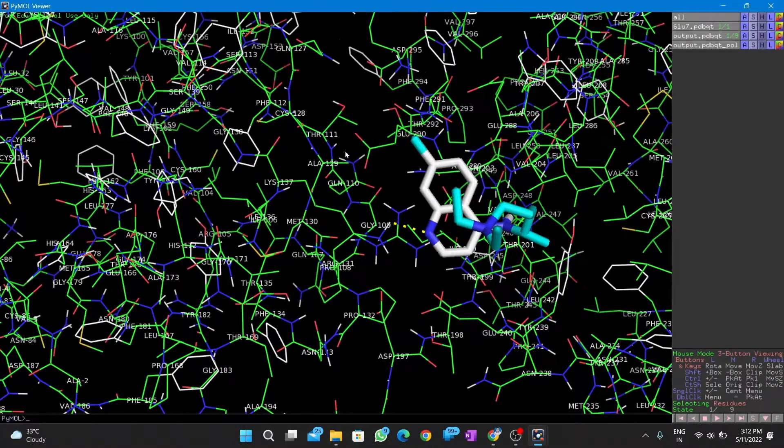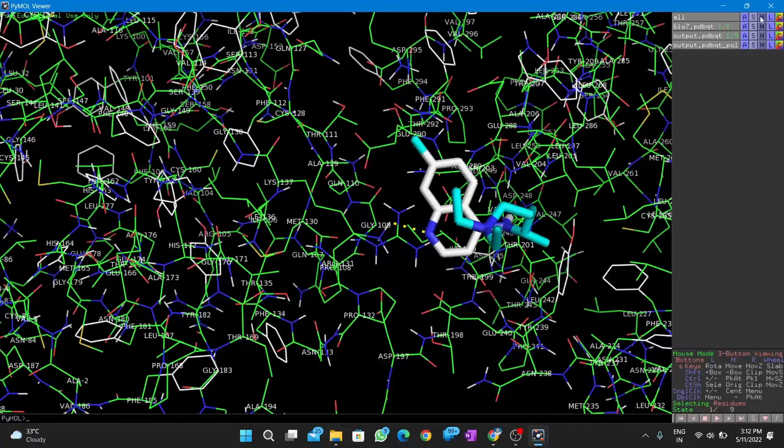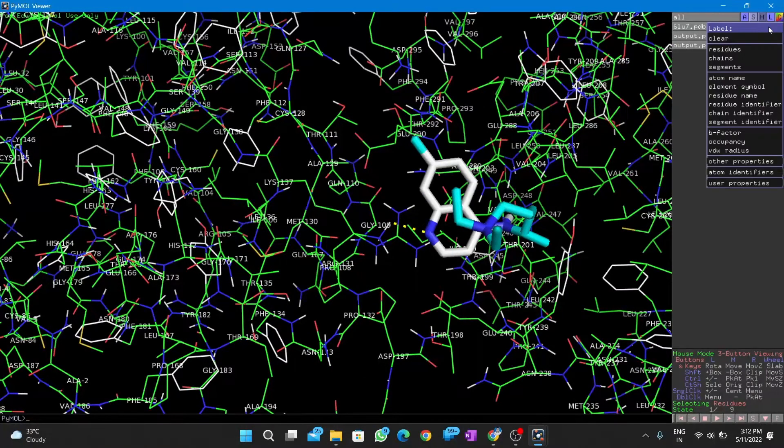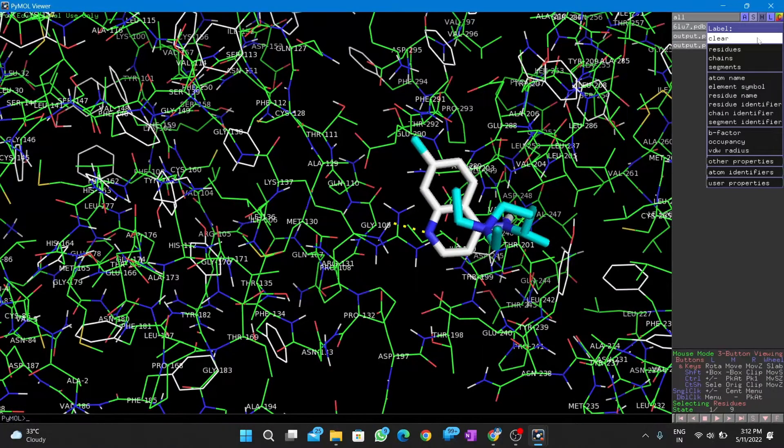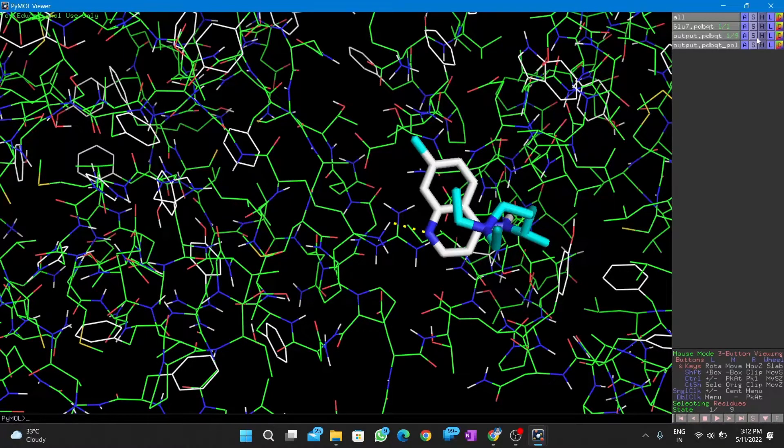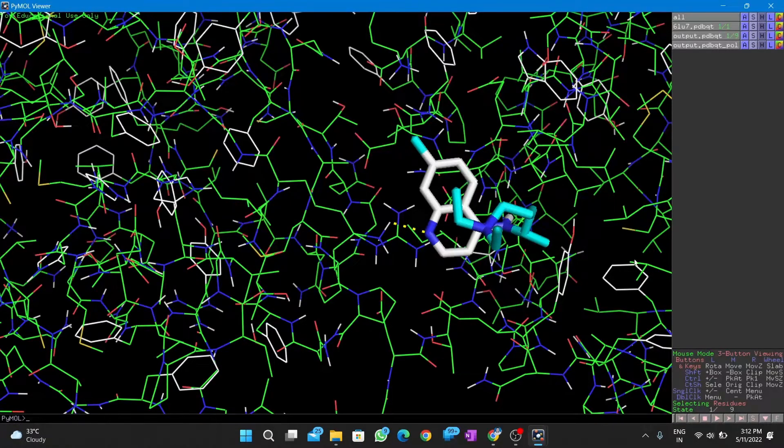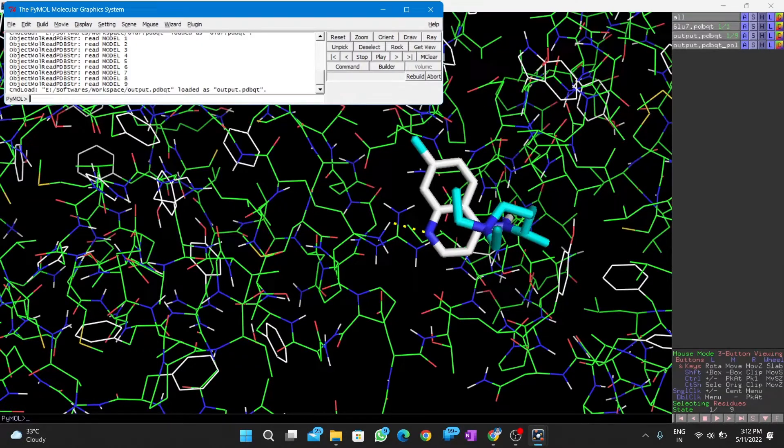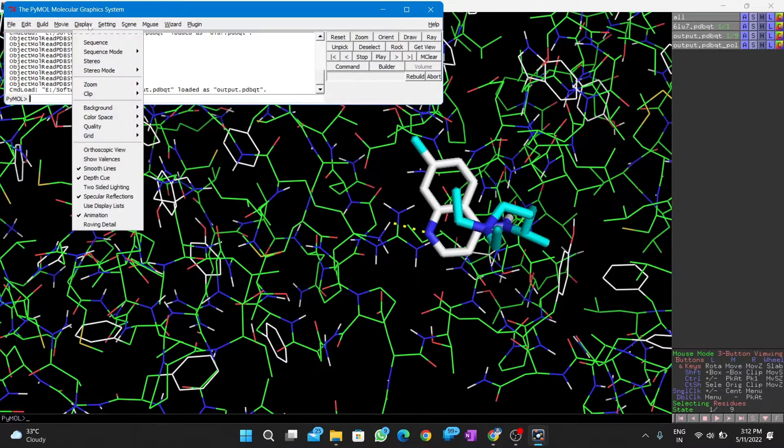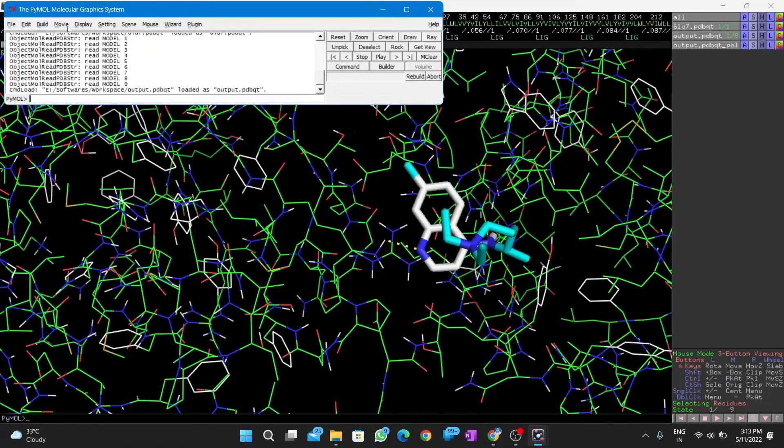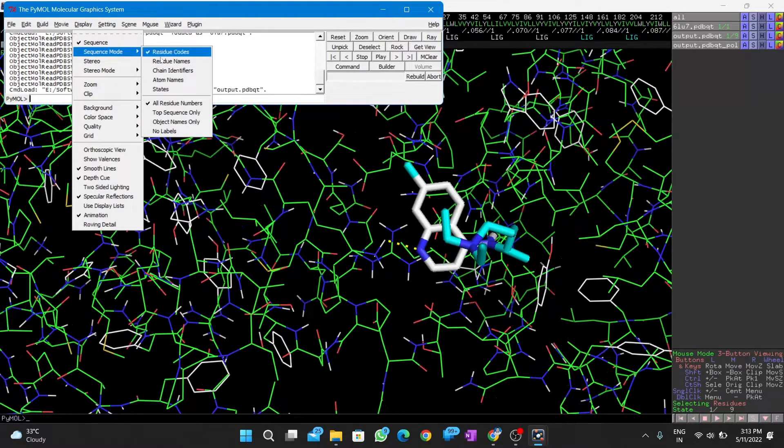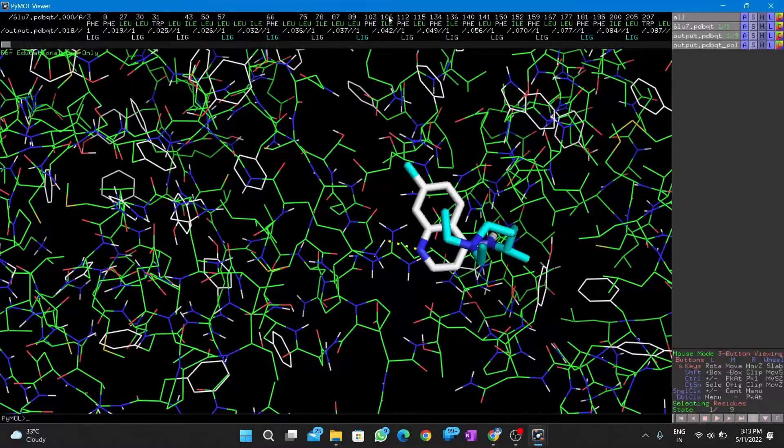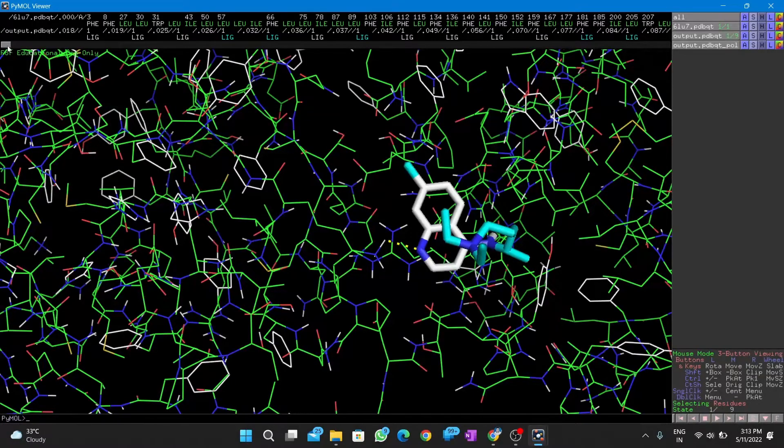We can see lysine at 137 is making polar contact. Next, we check the sequence and find out lysine 137 and select it from there.